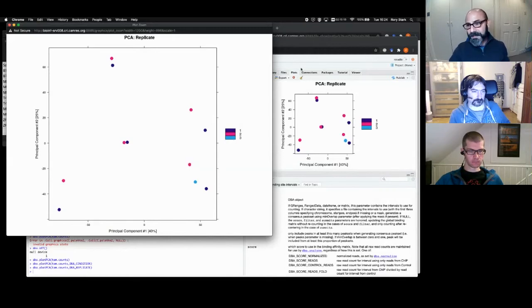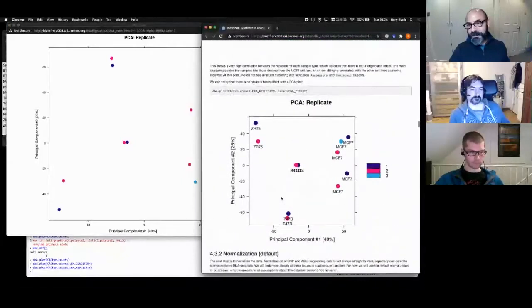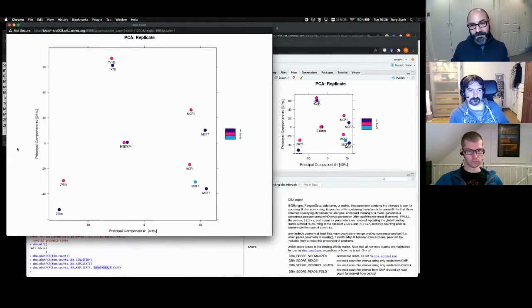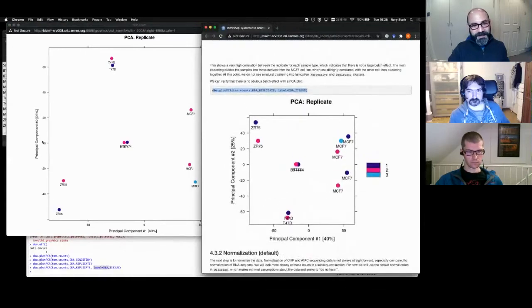You can put labels on these, by the way. I think in the example there's one. What did I put here? There we go. That was with the label for the tissue. I just added this label, and now we can see that we've annotated the dots with what tissue they came from. Okay, these are obviously useful plots, PCAs, good stuff. And that kind of gives us some sense of moving to the next thing, which is normalization.